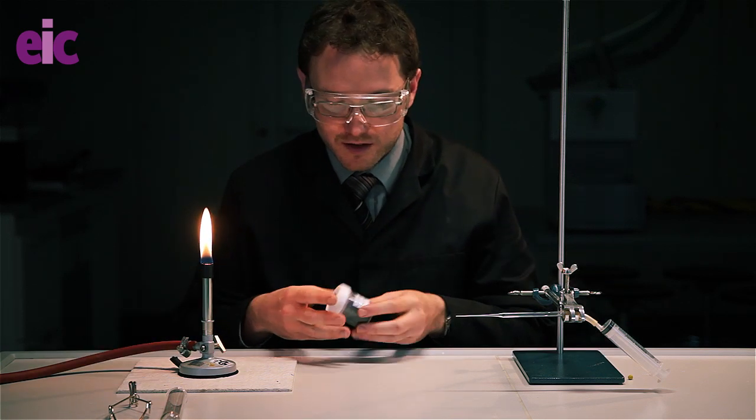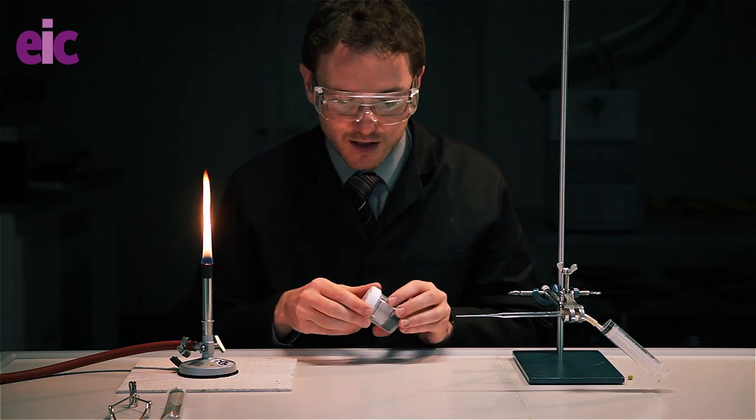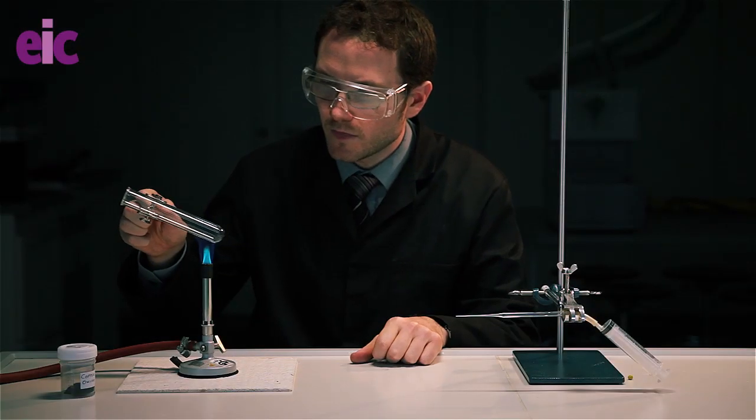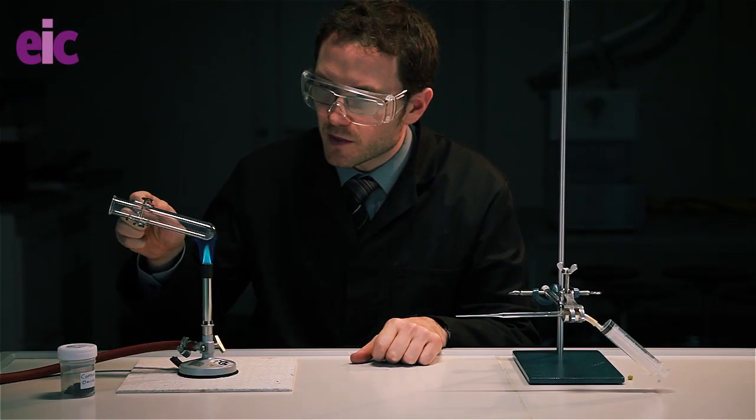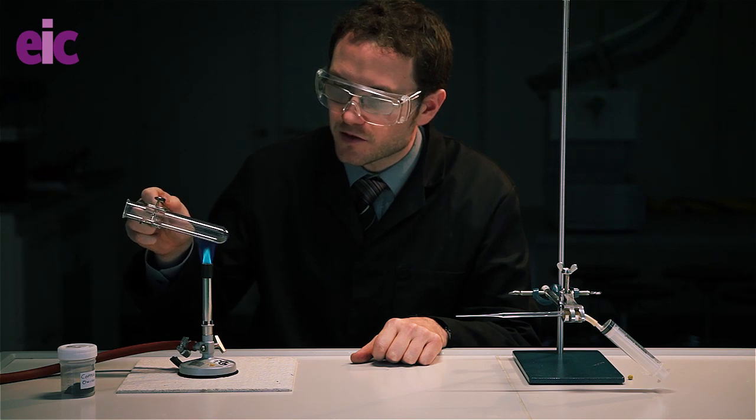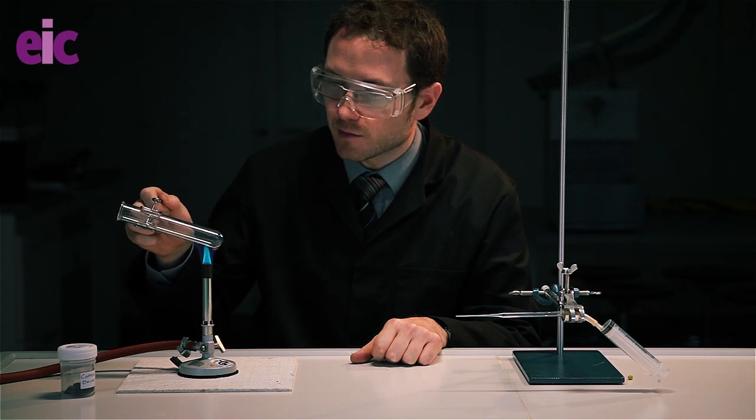I'm going to start off with some copper oxide. It's quite good at absorbing moisture from the atmosphere, so I'm going to dry this off in a Bunsen flame before I get started. Now we only need a very small amount of the copper oxide for this experiment to work, about a micro-spatula load, about 0.1 grams. So I'm just drying it off a little bit.